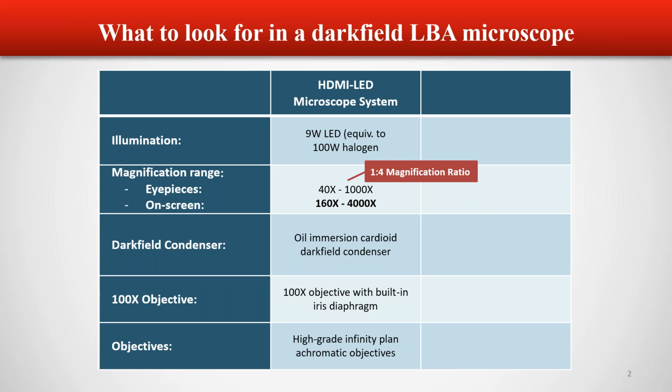Absolutely. Especially these small, fainter, pleomorphic growth forms that we usually look at at the end of the dark field analysis, they would require a bit of additional magnification to actually see them clearly. So in those cases, we use this 100 times objective.